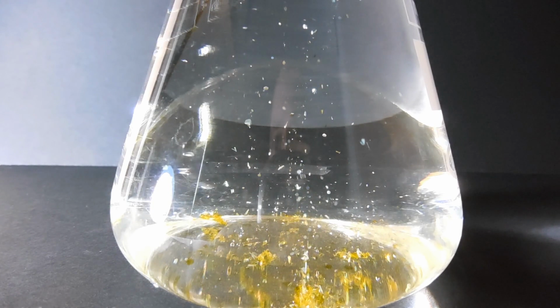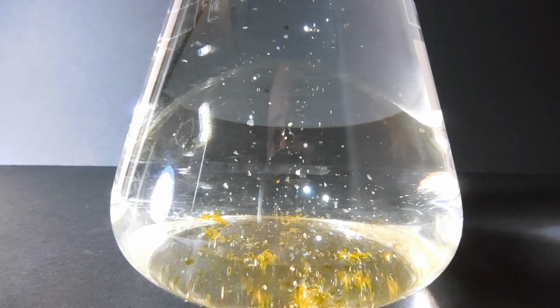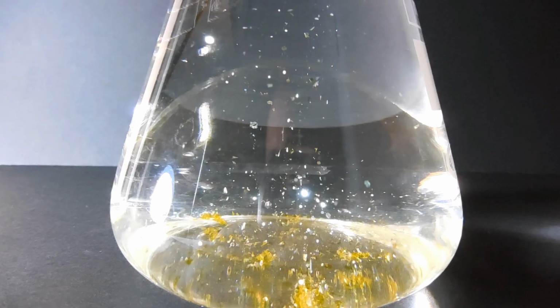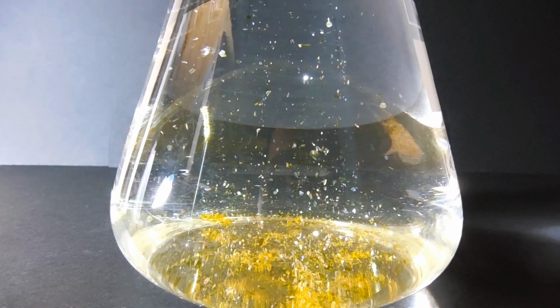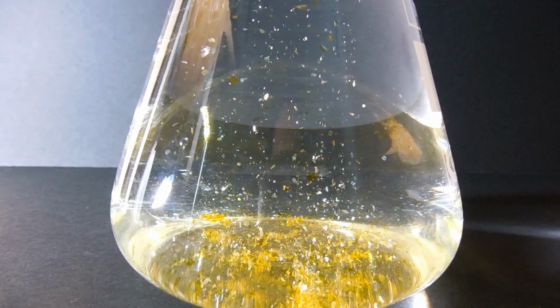And we get some convection currents in there because, of course, warm water rises, cold water sinks, so it carries these little platelets around. And so we get this really cool effect where everything is moving around and sparkling, and it just looks gorgeous. So now let's just sit back and enjoy the beautiful golden rain.